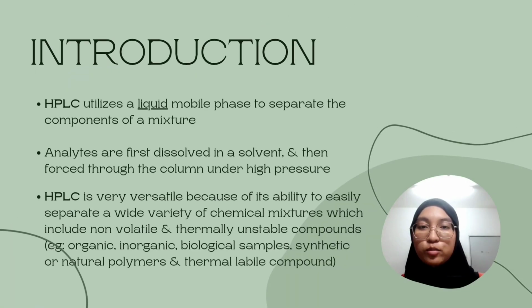Assalamualaikum and hi, I am Musfirah and I'm going to introduce you to HPLC, which stands for High Performance Liquid Chromatography. HPLC utilizes a liquid mobile phase to separate the components of a mixture. The analytes are first dissolved in a solvent, as it must be in the form of liquid, and then forced through the column under high pressure.